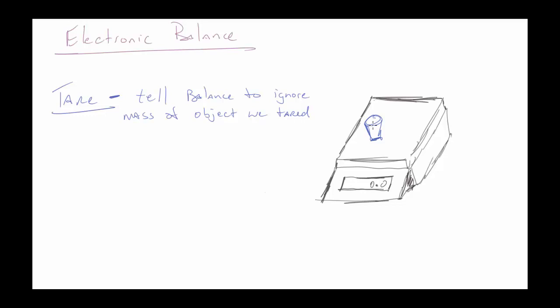That's something that is discussed in the lab procedure that you'll want to do in the lab today. The second thing is that we're going to have 3 different cups in our lab today, right? And in this particular case, we're going to have a cumulative mass going on. So if these cups are labeled number 1, number 2, and number 3, and I put some of my sample of metal into cup 1, then because I would tare out all 3 cups, my first mass would be just the mass of the metal in cup 1.